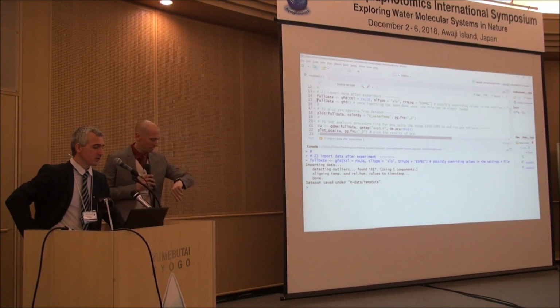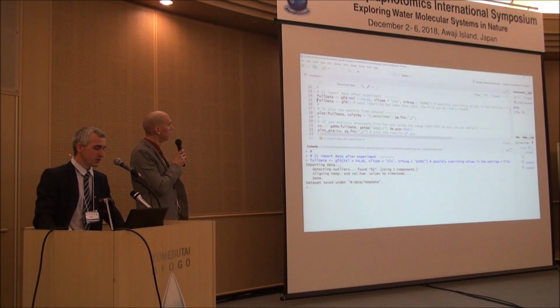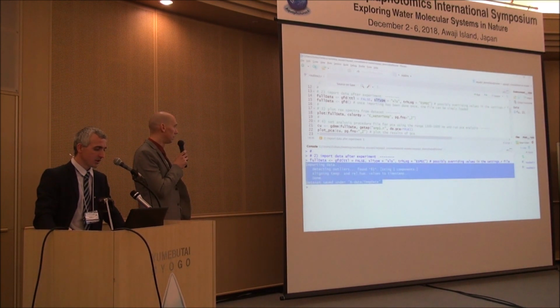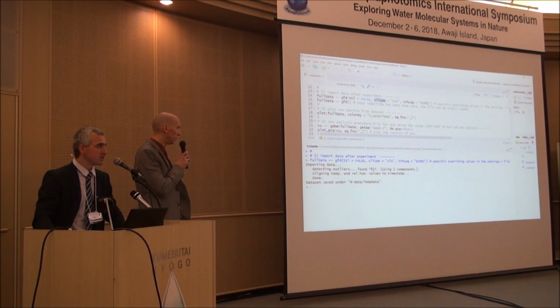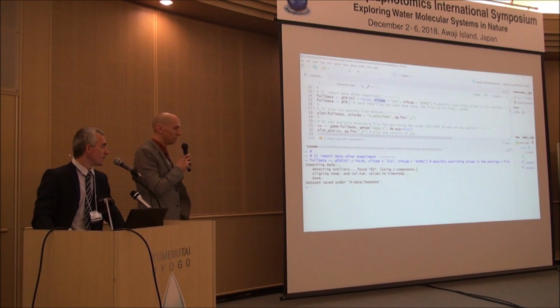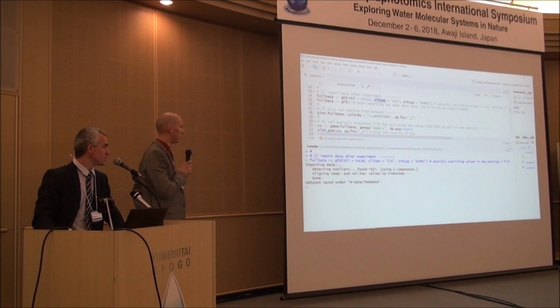Right, and after this, the import is very easy. You just execute line 14 with this GFD function, of course providing the sample type and the name of the temperature logger, and then you should see a message like it's projected on the screen, importing data. This is a very complex function. It combines all of these files, what we have seen, and even detects outliers based on some rules, and then at the end this data is saved on your disk.